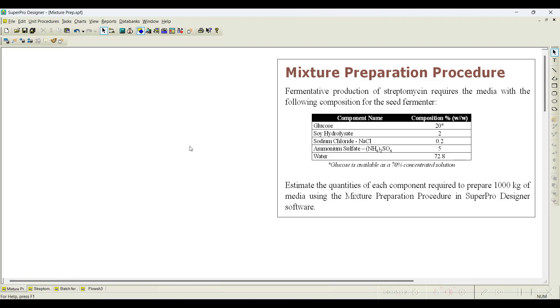Let us understand how to prepare a mixture using the mixture preparation procedure in SuperPro. I have taken a simple example with data extracted from the streptomycin production example problem available in SuperPro Designer. The problem states we need to prepare around 1000 kg of media with a given composition.